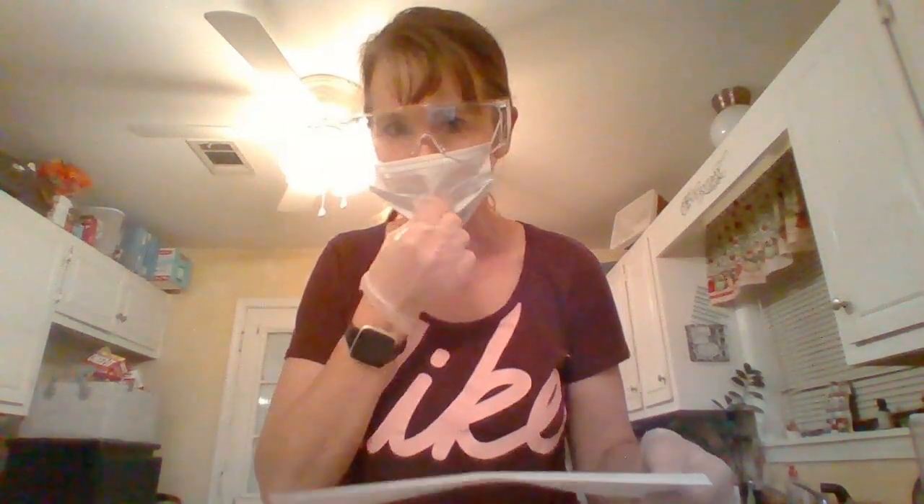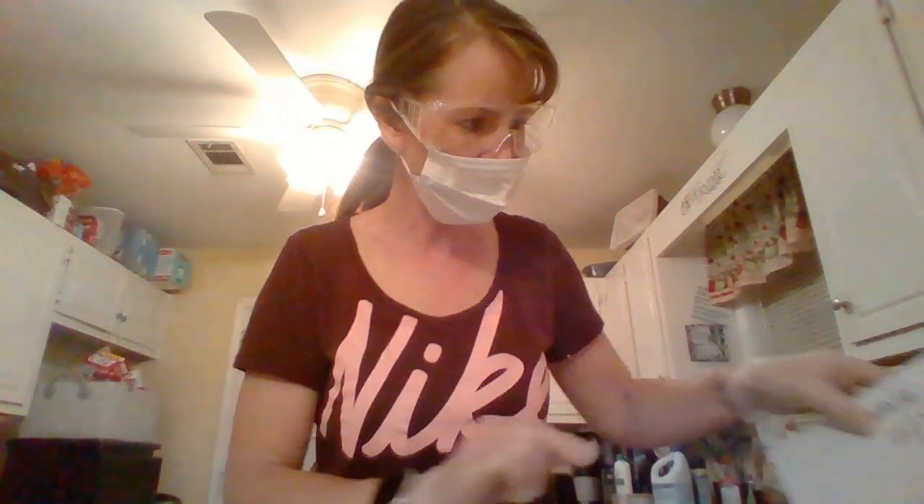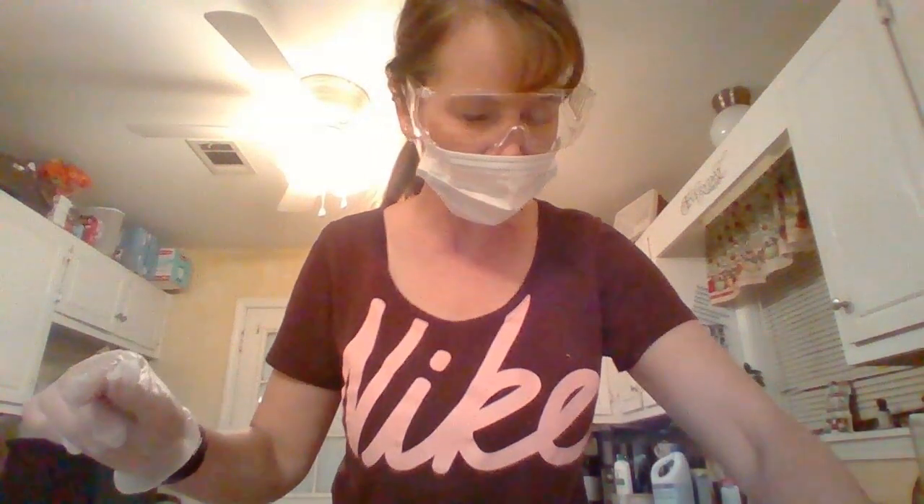My name is Jamie Taylor. Today is December the 3rd, 2022, and I'll be talking about the eye dissection — the cow eye.